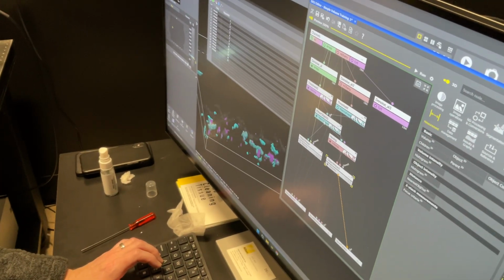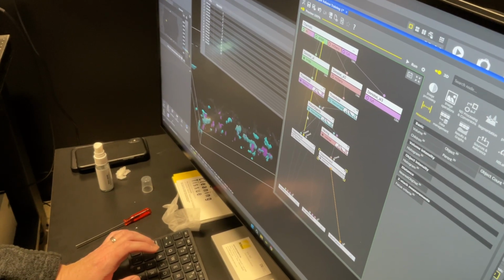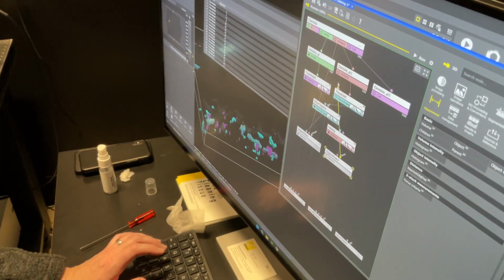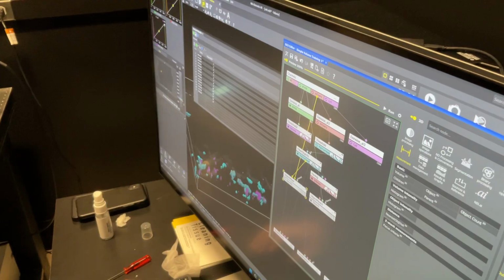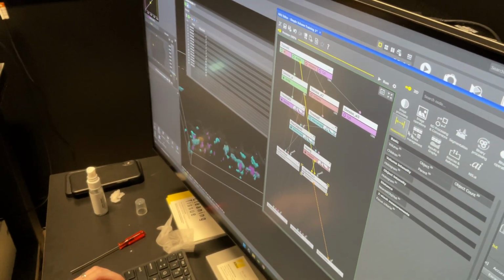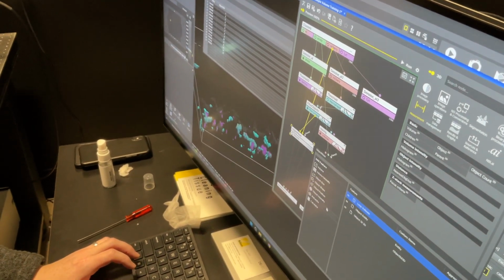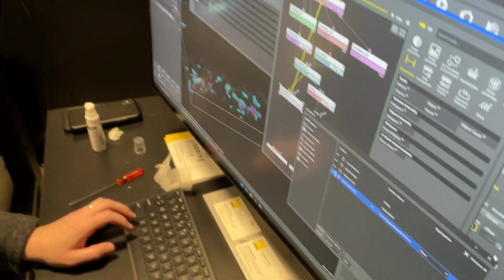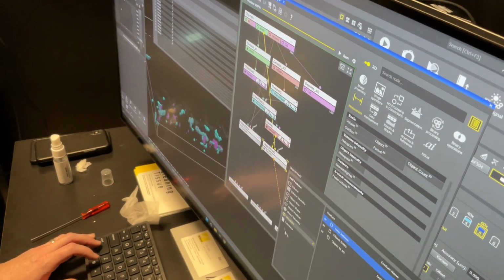So macrophages are, I'm sorry, this is opposite, right? Macrophages are M-cherry. Technically both are M-cherry, but infected also has GFP. This is where we have to do some data management. So now we've got our 2 things, we put in our measurement features, which is intensity, basically, for this, and this. There we go. Intensity.